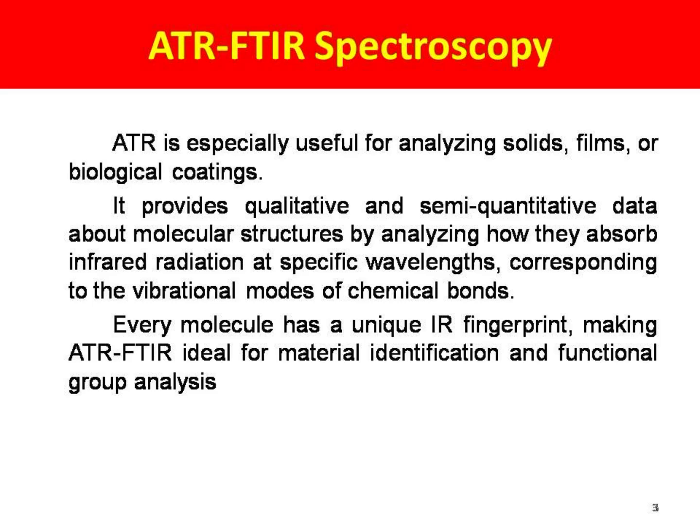ATR is especially useful for analyzing solids, films, or biological coatings. It provides qualitative and semi-quantitative data about molecular structures by analyzing how they absorb IR radiation at specific wavelengths corresponding to the vibrational modes of chemical bonds. Every molecule has a unique IR fingerprint, making ATR FTIR ideal for material identification and functional group analysis.